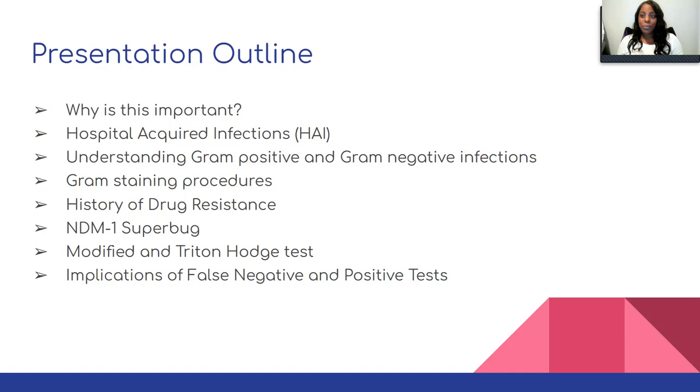We'll try not to bore you guys too much. And it'll just be about the Triton Hodge test, which is the modification to the modified Hodge test. And then we'll also talk a little bit about the implications of false negatives and false positives in the healthcare setting.